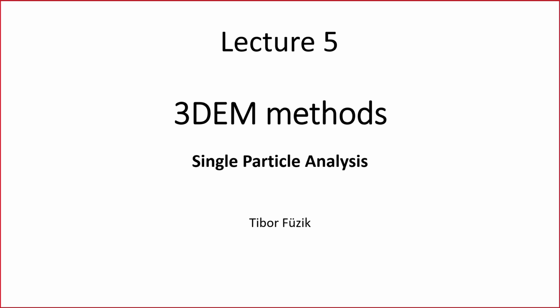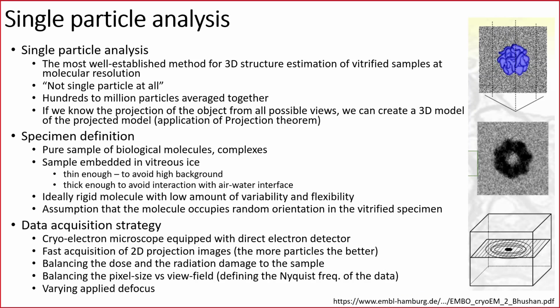Actually, this is not lecture 5, this is lecture 7 already from the 3D methods. That's about single particle analysis, the workflow, and how the procedures in single particle analysis work. What is single particle analysis? Single particle analysis is nowadays the most well established method that we can use for determination of 3D structures of our model using cryo-electron microscopy.